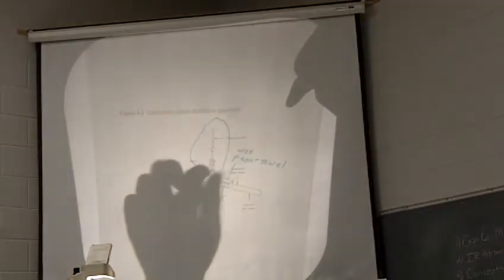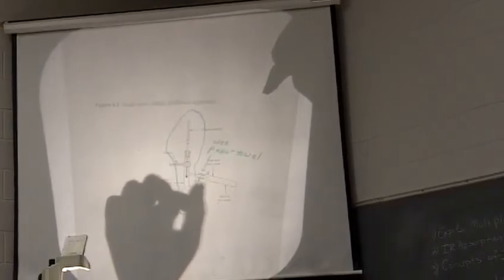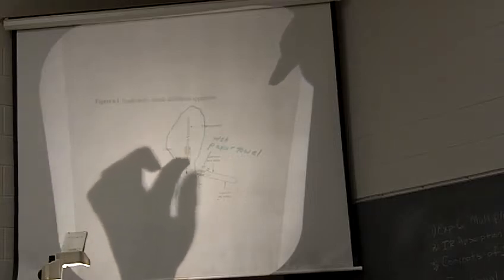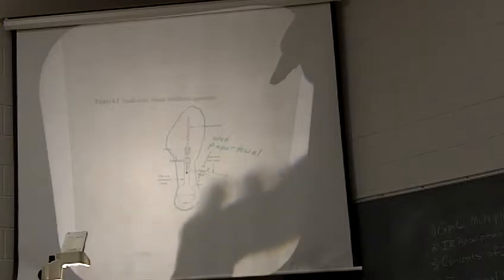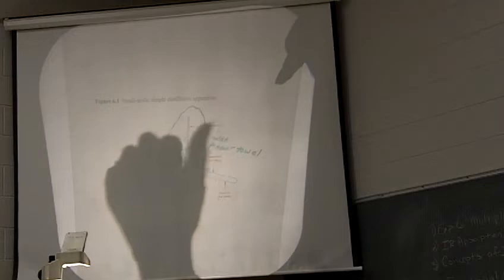Couple things to be careful of. First of all, you're going to clamp it. You want to make sure you have a stir bar in here when you start heating it. You all have different unknowns, so instead of using a hot water bath, you're going to use your heating mantles again for heating the unknowns and distilling them. Okay? So we can't tell you exactly what temperature to distill at, so you're going to have to be kind of vigilant if you have a liquid as far as figuring out how much heat you need to give it in order to get it distilled.